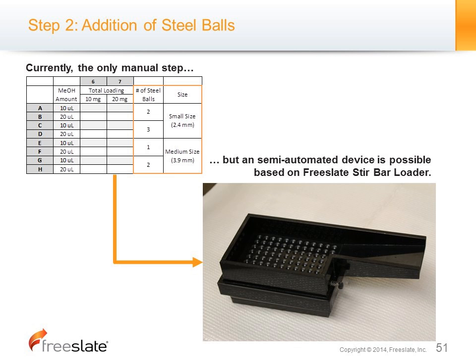We do have a loader for stir bars, which we use every day for a variety of experiments, from solubility studies to reaction screening. In this case, you have this stir bar loader, and you pretty much dump the stir bars into this, and all the stir bars will trap into the little slots in here, but the trap door is still closed, and the rest of it you just dump out.